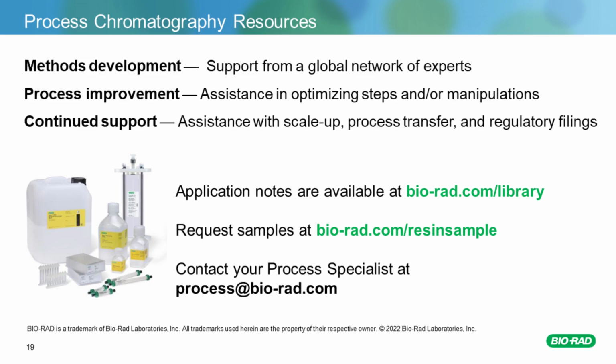Okay, great. As a reminder to our audience, you can go ahead and type in your questions for our speaker now. So our first question is, would you be able to use the Nuvia HPQ for oligos that are larger than 20 mers?